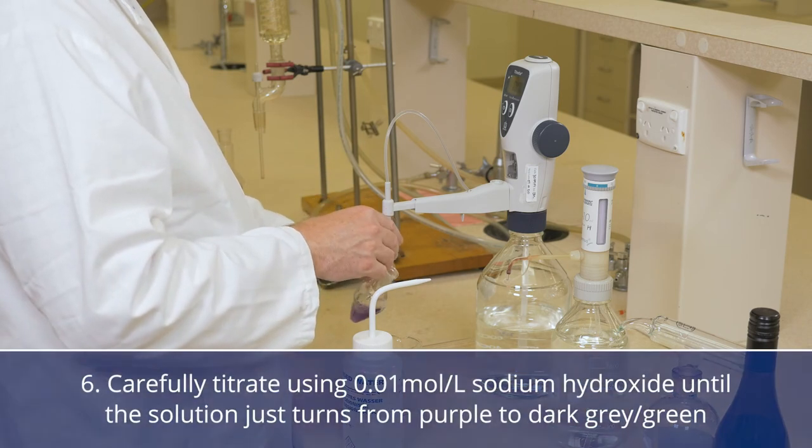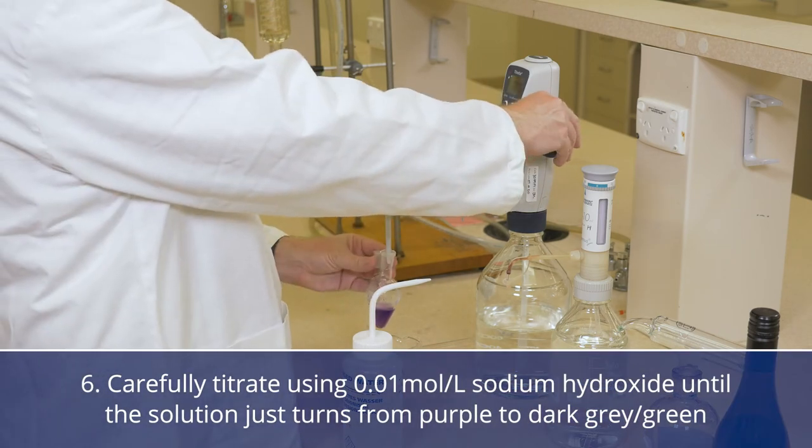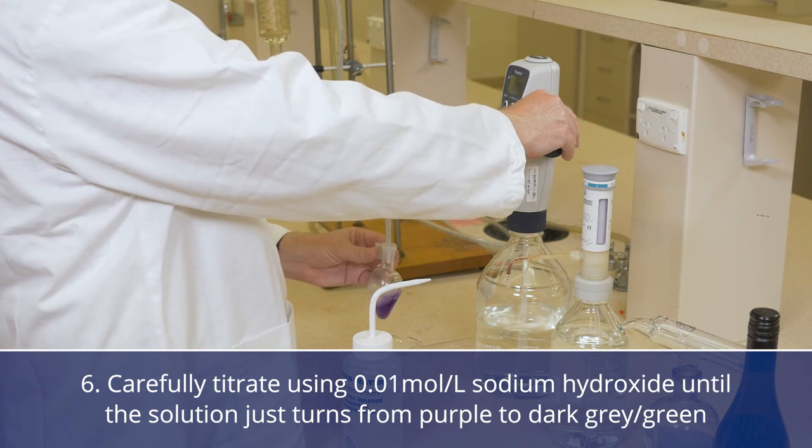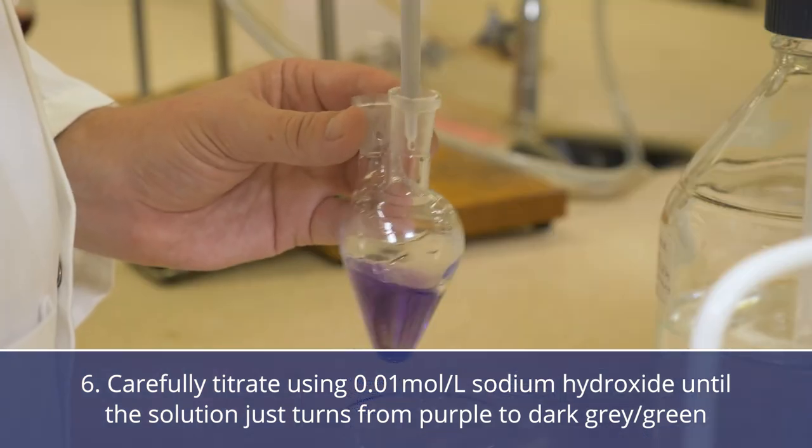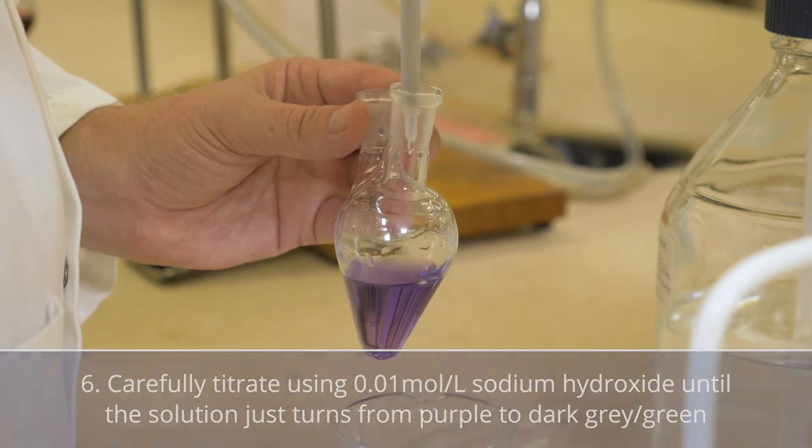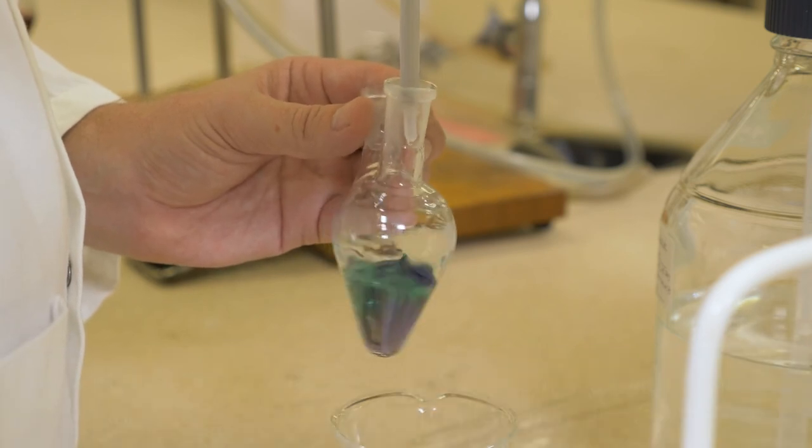Carefully titrate using 0.01 M sodium hydroxide until the solution just turns from purple to dark grey-green while constantly shaking the pear shaped flask.